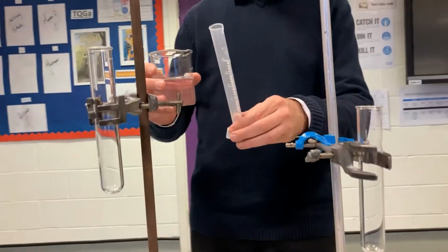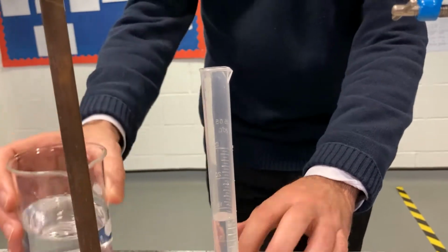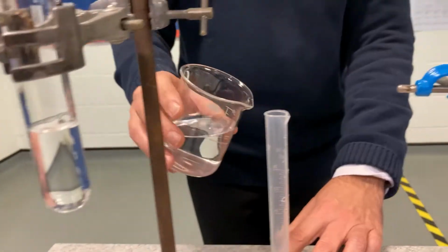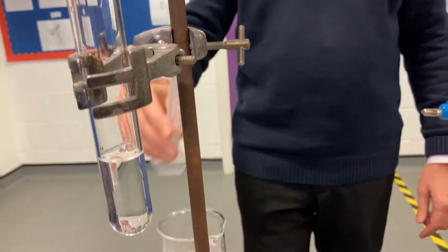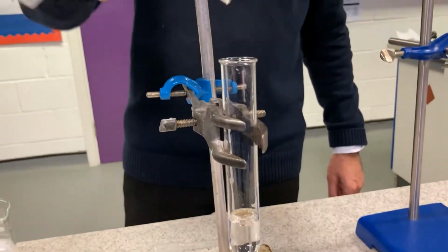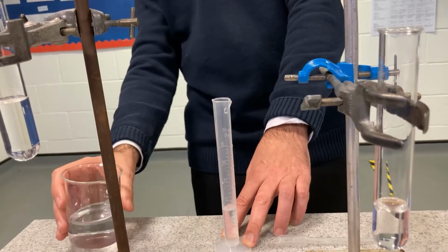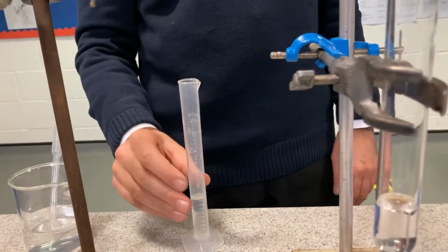So first of all, I'm going to measure out 10 millilitres in each of these. So it's got to be a fair test. If we don't measure the same amount of water, it is just not fair. And we're not going to get a sensible answer. And it's all about sensible answers. And that's at 15. Don't want that. A little bit more. Use a pipette, be super accurate. There we go, 10 millilitres.